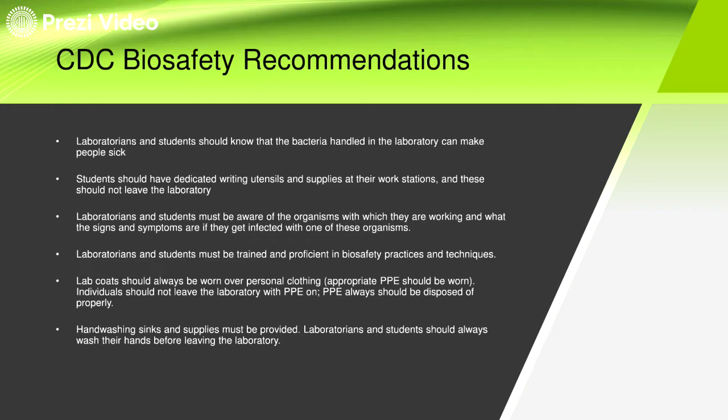And then, of course, laboratorians and students must be trained and proficient in biosafety practices and techniques. So, that training and proficiency is first done in school, right? While you're studying. Then, once you are licensed, there are additional training requirements for RMTs before you work in specialized labs such as the microbiology lab, the TB lab, or even the virology lab. You don't just enter the virology lab without knowing anything.